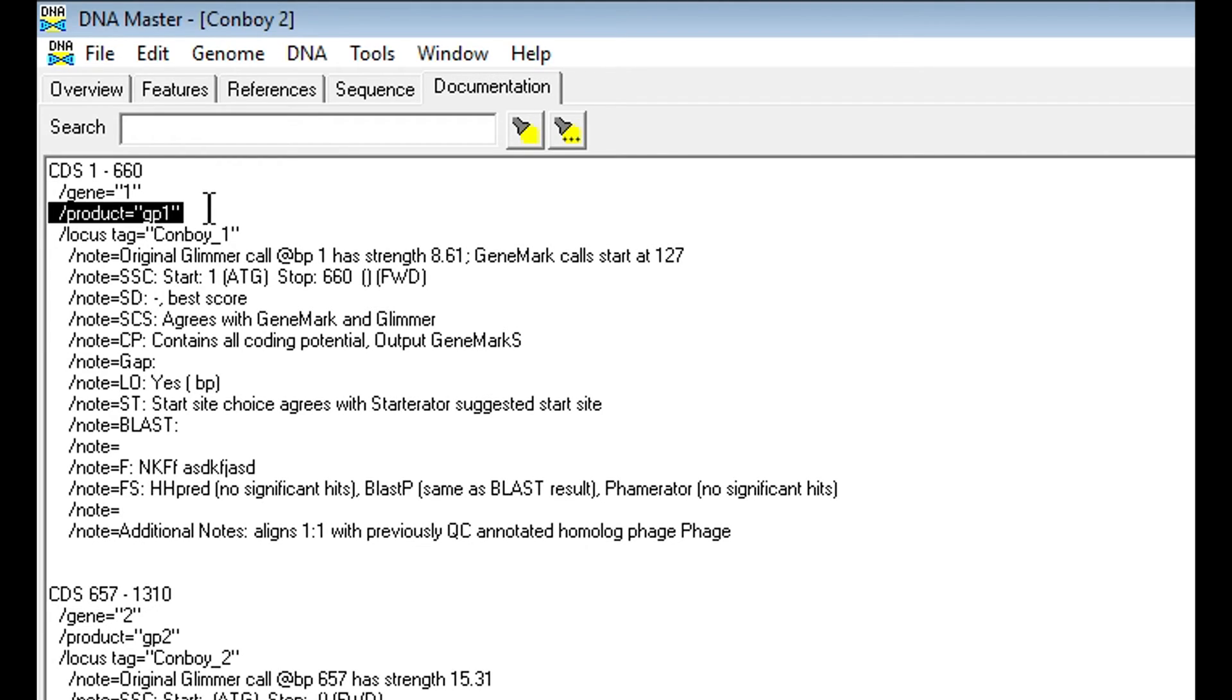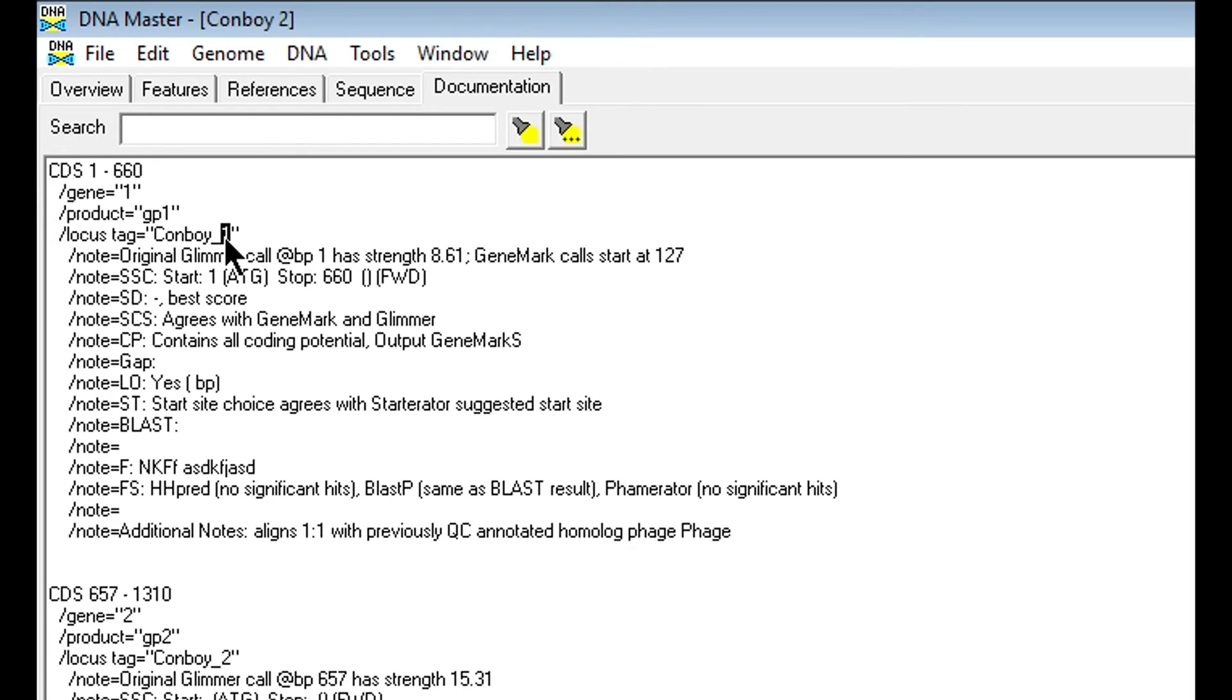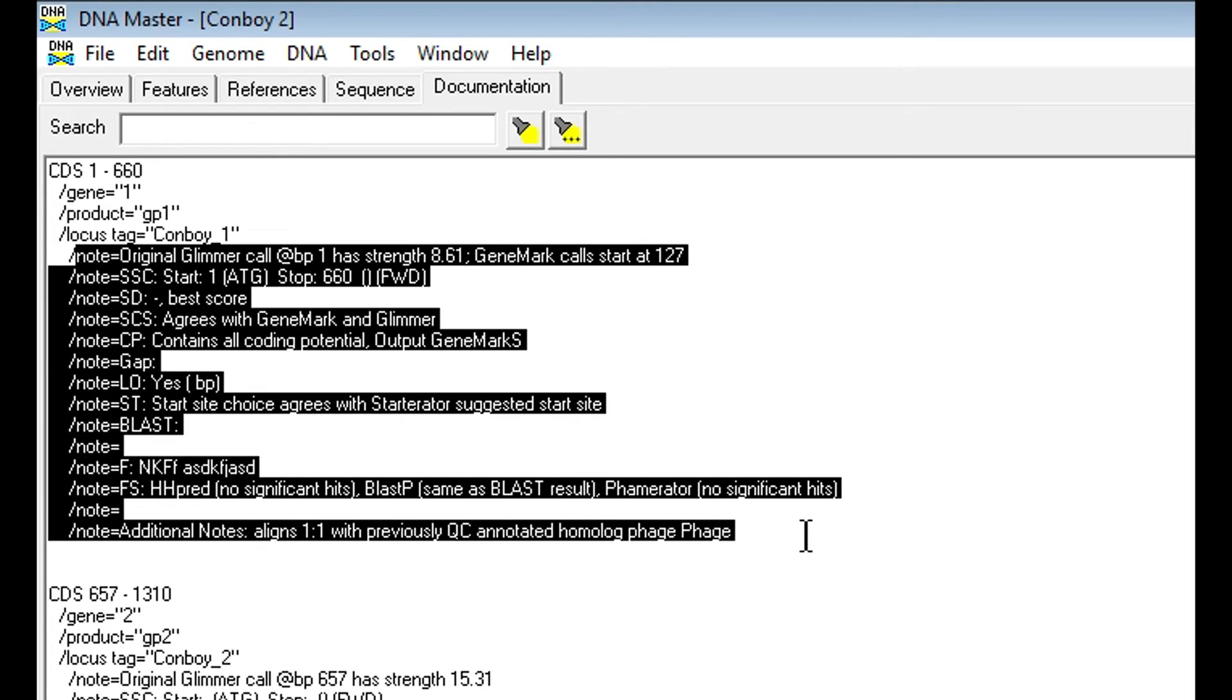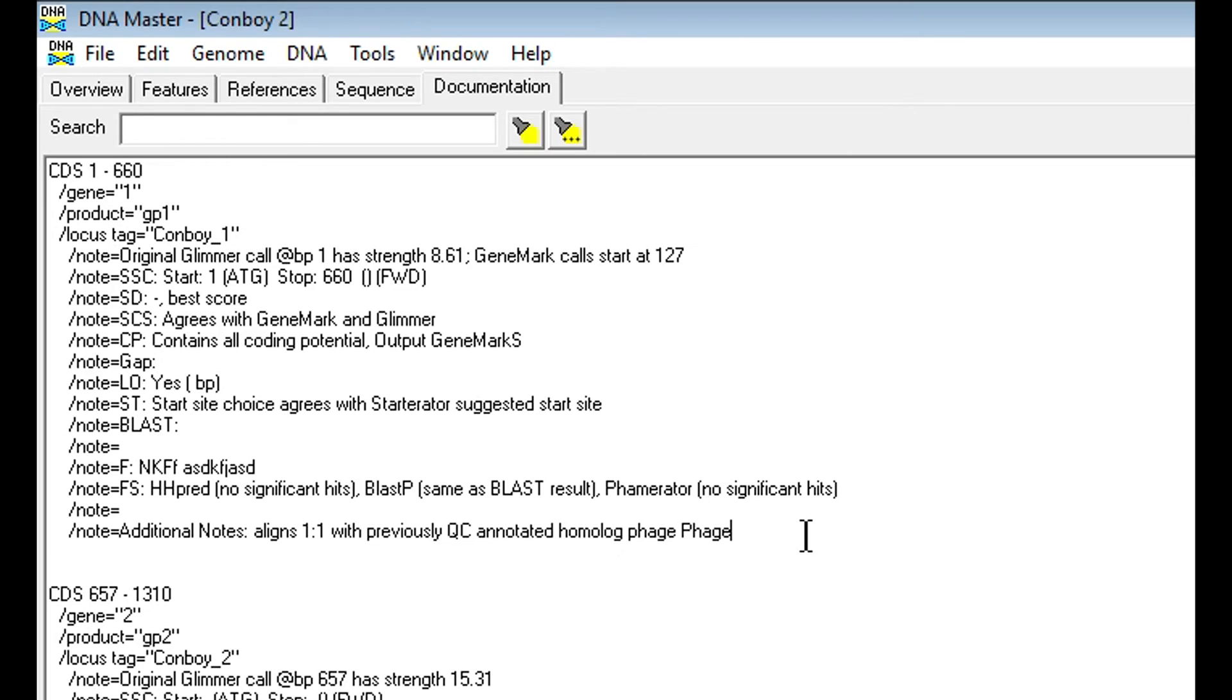It's just going to copy the notes section of that gene into the documentation tab only after you've recreated it. Like I said, you're not going to be working in here too much, so not to worry about the documentation too much.